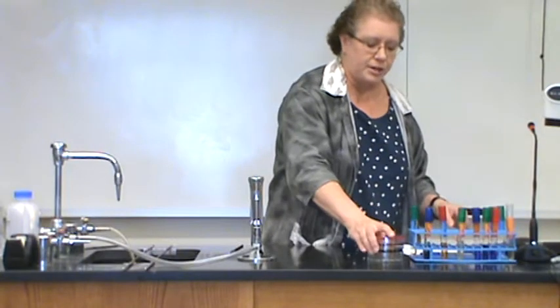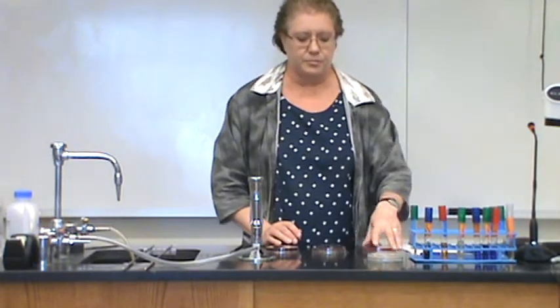So the first three, you'll see it's 2, 3, and 4, are media that you are familiar with: an MSA plate, a MacConkey plate, and an EMB plate. You have labeled all these with the type of plate, your unknown, and your initials. Remember, we use them lid side down, so we can just pick it up and inoculate it.